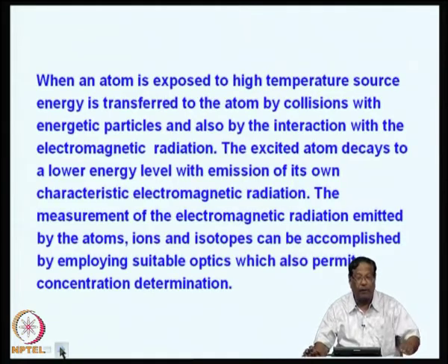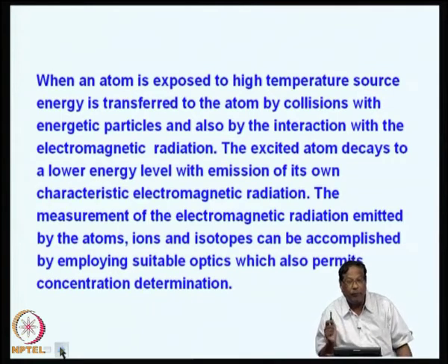So, when an atom is exposed to high temperature, we know that energy is transferred to the atom by collisions with energetic particles and also by interaction with the electromagnetic radiation.